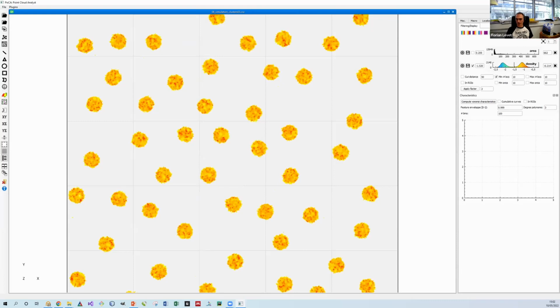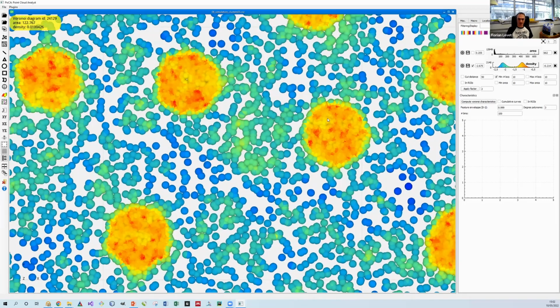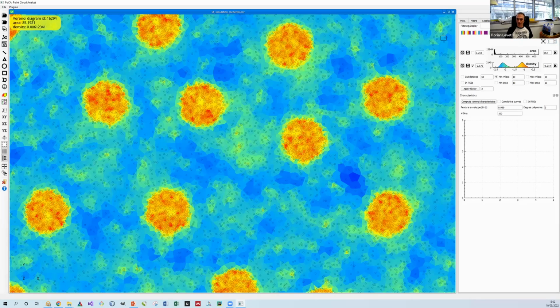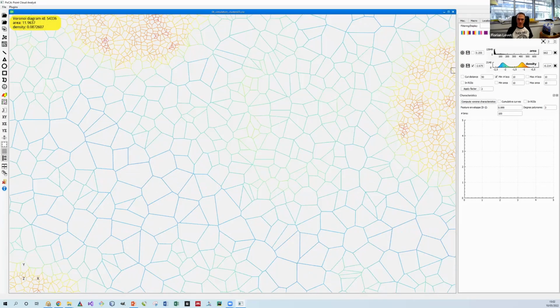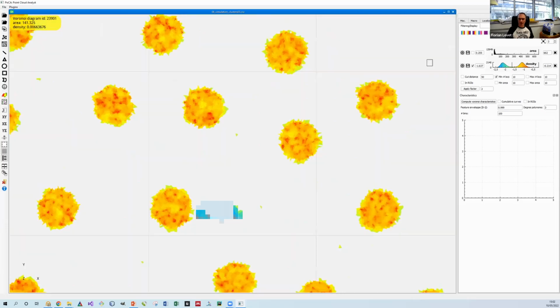You can also display points with the Voronoï density here. So here you can get rid of the Voronoï polygons, and you can see only the points and the points with the density. You can also show the outline of the cell with this button instead of them being filled. You can invert the selection if you want with this button.